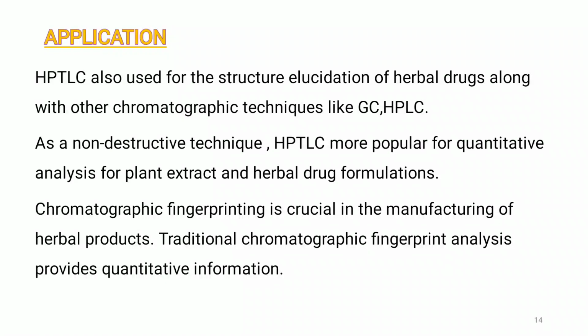At last, I can conclude from the above presentation that applications of HPTLC include phytochemical analysis, biomedical analysis, herbal drug quantification, analytical analysis, fingerprint analysis, and HPTLC's future in a combinatorial approach.